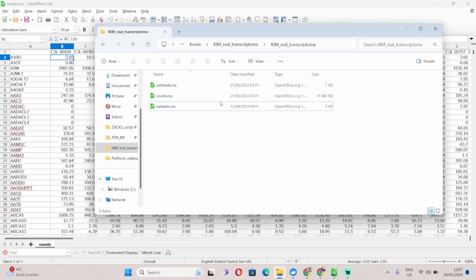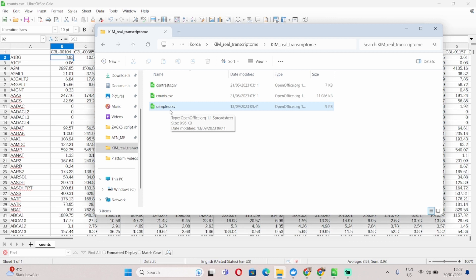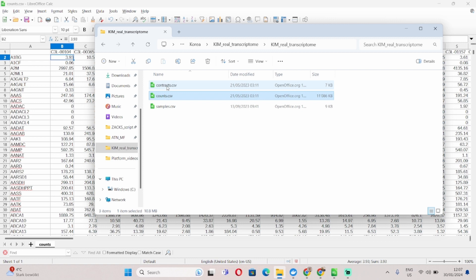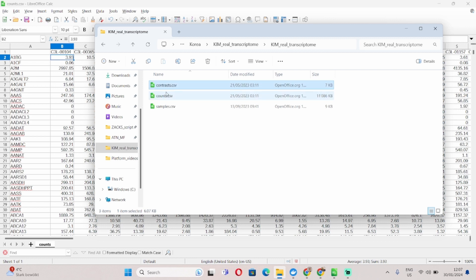So I'll start by talking about the naming of the files. There are three input files that the platform accepts. Two of them are compulsory, the samples and the counts file, whereas the contrast file is optional. You can generate that through the platform rather than creating it yourself and I strongly recommend you use the platform interface to generate this file.